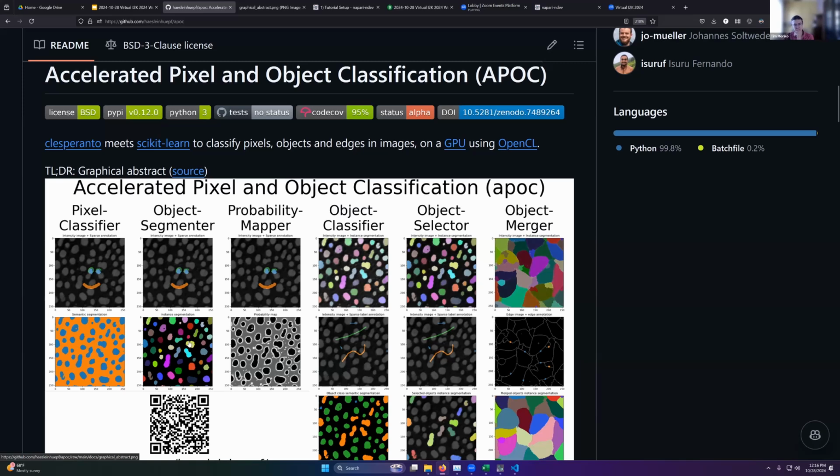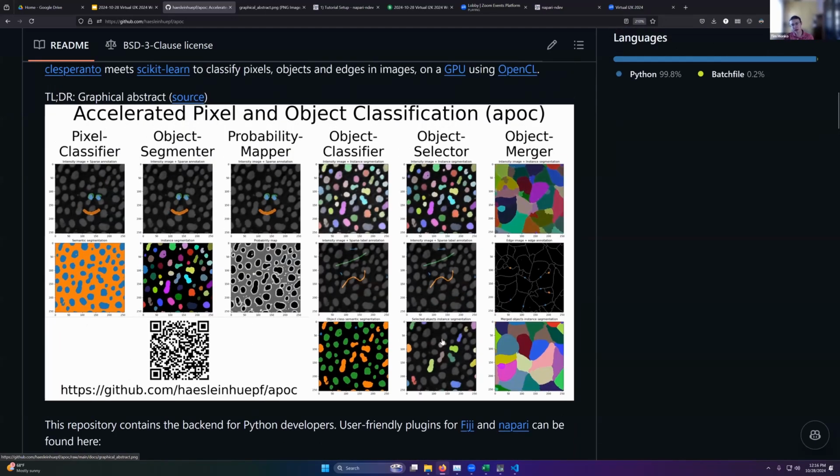So object classification segmentation is probably the most common use I would say that I've seen so far. You can also later, I'm adding this to the plugin, classify objects. So this is just the classic blobs.tiff. These are labeling dividing cells, the green ones are labeling single cells, and then you can see, oh, we've got dividing cells and we've got single cells or elongated.